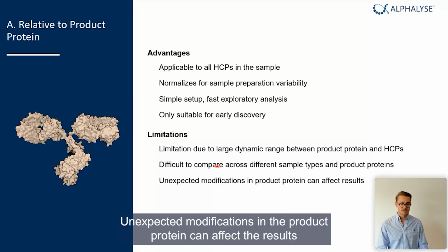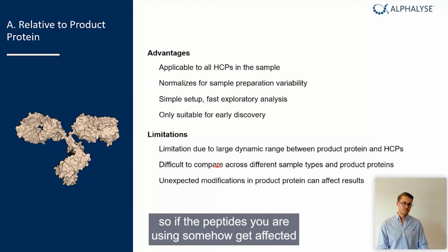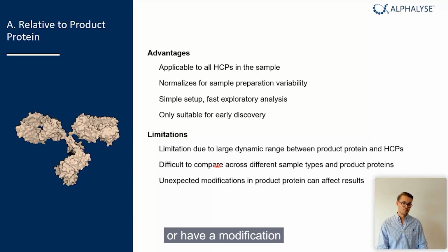Unexpected modifications in the product protein can affect results. So if the peptides you're using somehow get affected or have a modification, this can affect your results.